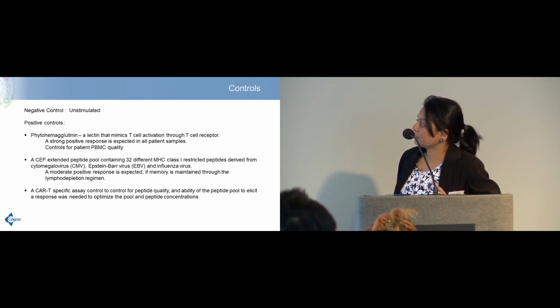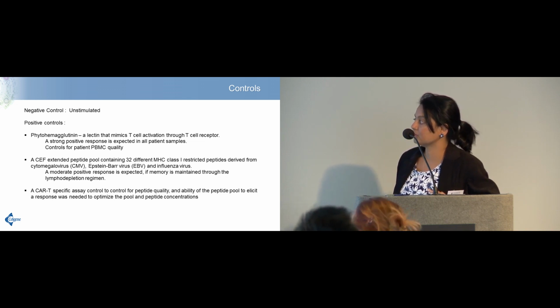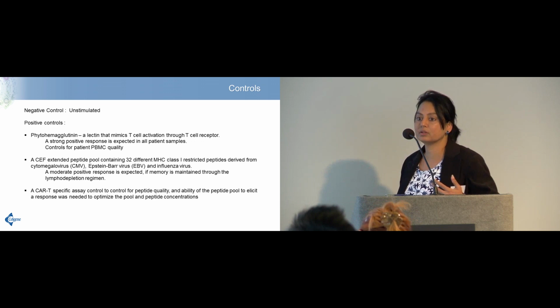The CEF peptide pool was a less sensitive control, but this was interesting. We had an option of completely leaving this out, but I thought this was interesting because the CEF peptide pool works because the patients are expected to be exposed to these kinds of peptides during the course of their lifetime.